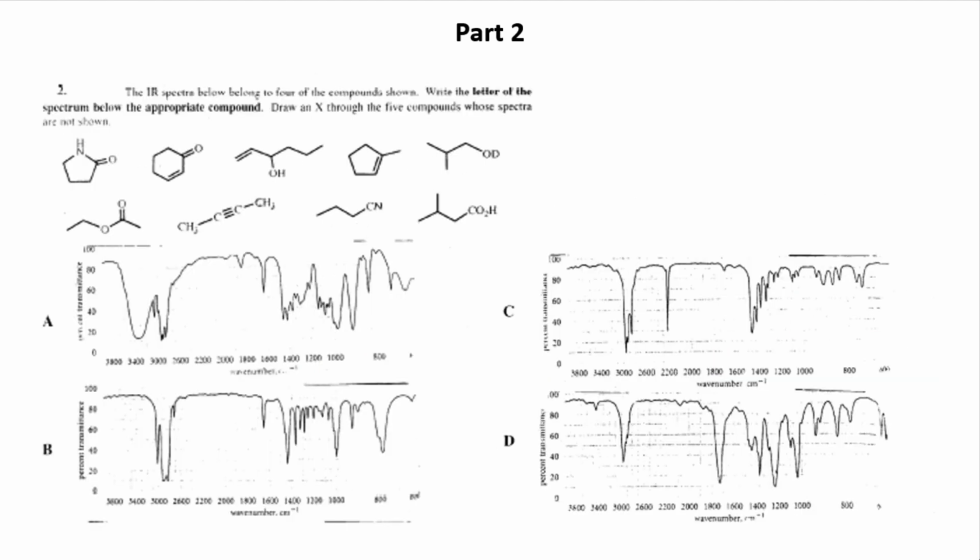It's also a typical exercise as well. You should be able to identify the kind of compounds. So straight away you can see there's possibly an OH group here. You find the kind of functional groups and the region each belongs to, and then you use it to identify the compounds listed.